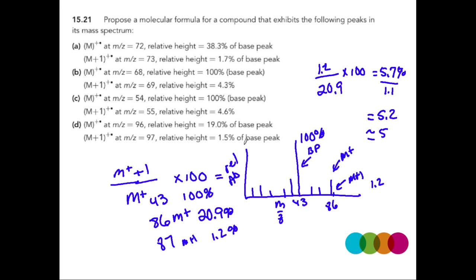So if I were looking for my molecular formula, that means this molecular formula is C5. And I've been given the molecular weight. So my molecular weight is 86. Okay, so what is the weight of 5 carbons? So I can say C5 is equal to 12 for carbon times 5, which is 60. Okay, so 86 minus 60 is equal to 26.